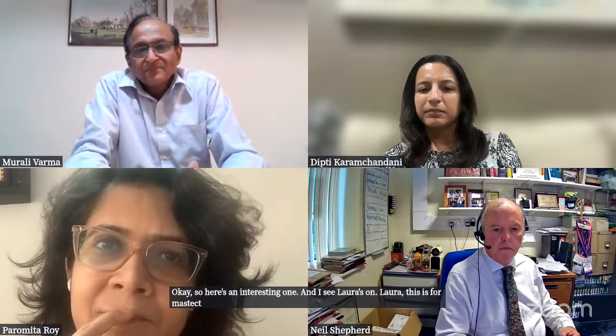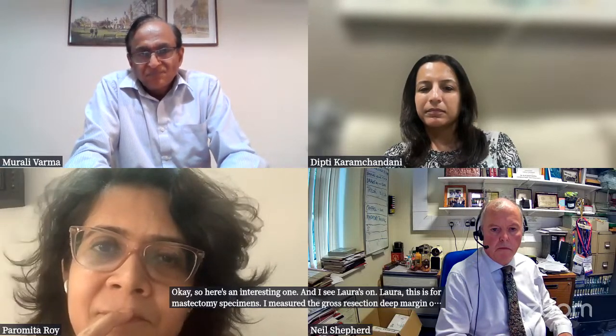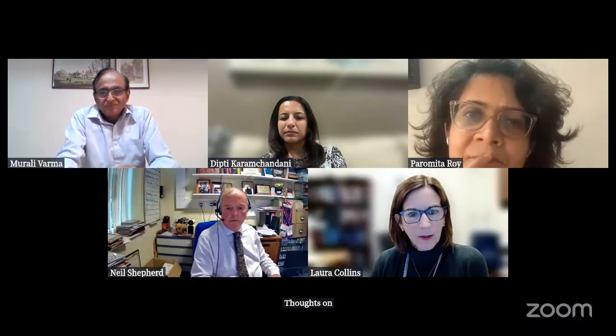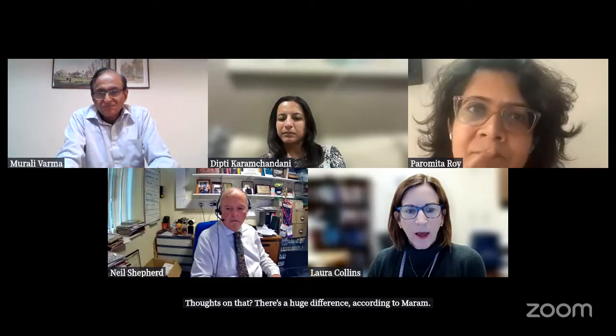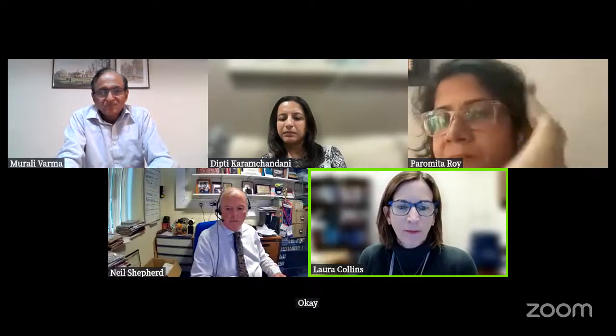Okay, so here's an interesting one, and I see Laura's on. Laura, this is for mastectomy specimens. I measure the gross resection deep margin on fresh, and then measure it again after fixation. Thoughts on that? There's a huge difference, according to Maram. Well, I'll be talking about this later on, so I have a big discussion on margins.